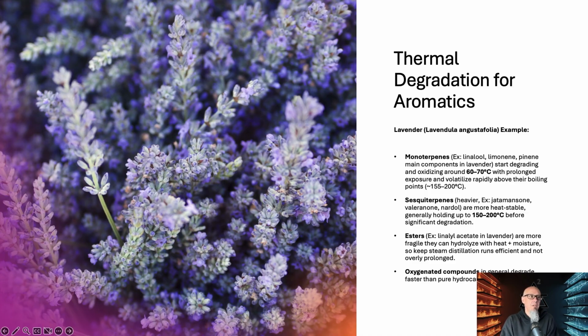The esters here, the linalyl acetate, which is what we're actually after, those are more fragile. Okay, those actually hydrolyze with both heat and moisture. So the steam distillation runs, they have to be efficient and they cannot be prolonged over time.